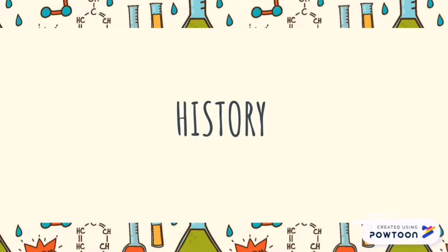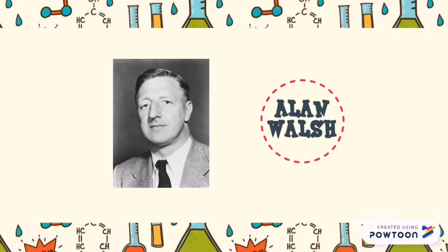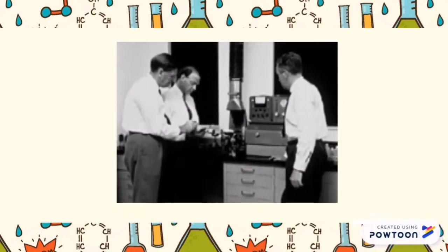History. This technique was discovered in 1955 by Alan Walsh in Australia. The first commercial atomic spectrometer was discovered in 1959.